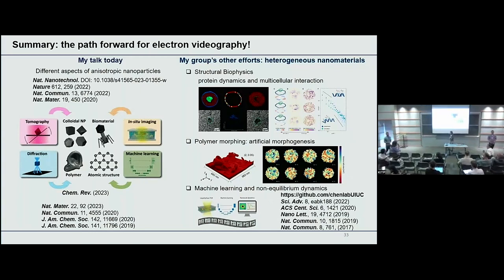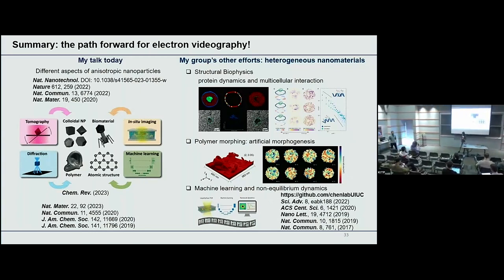You've shown in the beginning of the talk the self-assembly of, as I understand, triangular particles, right? So you were focusing on two order parameters. Yes, one is bond orientation, another is just local density. Right. Is it feasible to actually measure the orientational order parameter associated with particle rotation itself? Because this is different, right? I see. Is it practical?